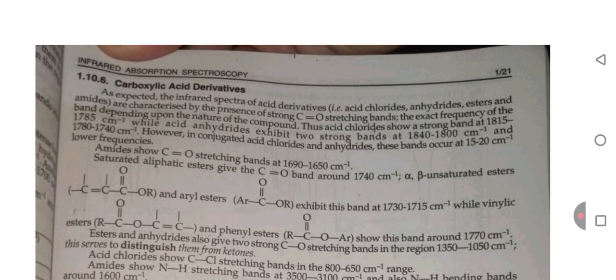to 1740 cm inverse. However, in conjugated acid chloride and anhydride, these bands occur at 15 to 20 cm inverse lower frequency. Amide shows a carbon double bond oxygen stretching band at 1690 to 1650 cm inverse. Saturated aliphatic ester gives the carbon double bond oxygen band around 1740 cm inverse. Alpha beta unsaturated ester and aryl ester exhibit this band at 1730 to 1715 cm inverse, while vinylic ester and phenylic ester show this band around 1770 cm inverse.